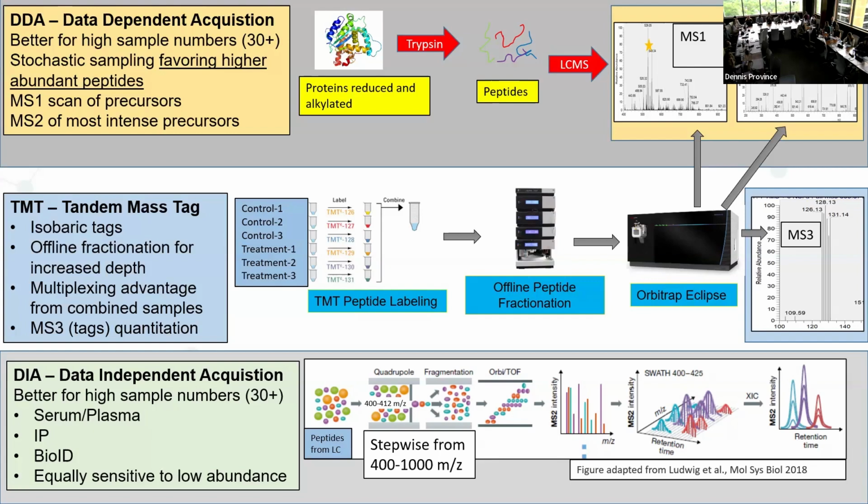Whoa! So now we get this multiplexing advantage in that one peptide that was in one sample, that same peptide that's in the other samples, they're all going to come out at the same time. And so you're going to get a higher response for each peptide. And you're only measuring it one time. Instead of measuring that peptide in sample 1, and an hour later, you're measuring that same peptide in sample 2, and an hour later, in sample 3, and then you have this instrument maybe changing as time goes on. In TMT experiments, you're measuring that peptide one time for all your samples.